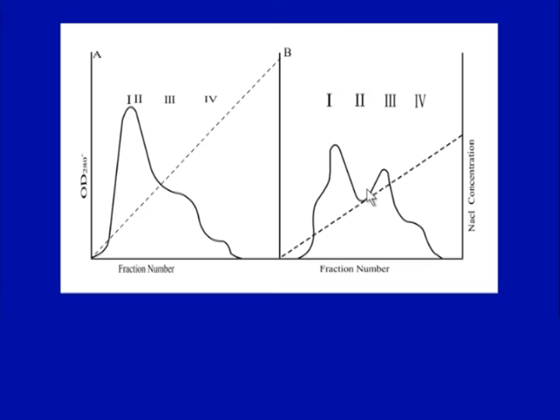So, that is very important, that separation of 4 peaks by ion exchange chromatography is taken here, but in the higher steep gradient only one peak is very clear, other peaks are not so clear, but in the shallower gradient peak 2 and 3 also become clear, and existence of the fourth peak becomes obvious. So, as you go along doing these things, general guidelines are very clear, but one has to standardize one's own conditions to get best results.